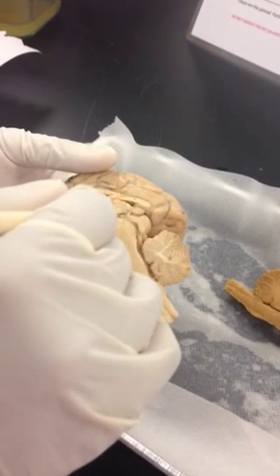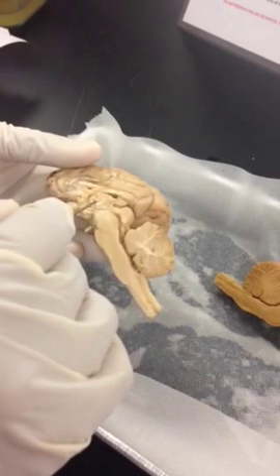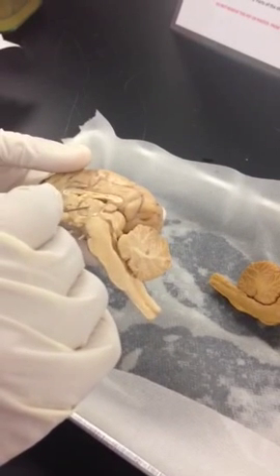The brain, you will see that. It's very obvious. That's your thalamus. Then if you see a word intermediate mass, that's the center part of the thalamus.